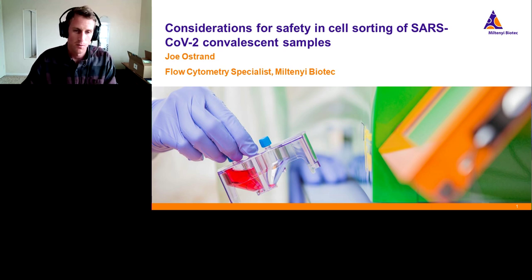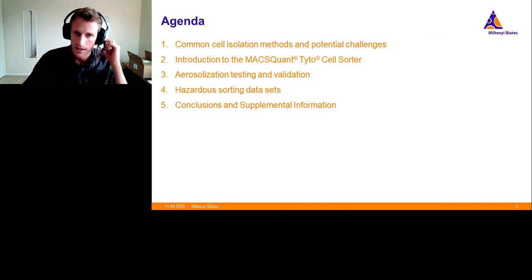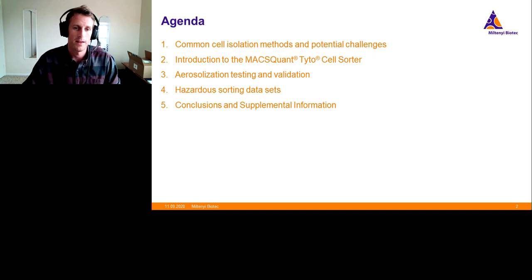But with that, I will go ahead and jump into this. From an agenda perspective, I want to go through the challenges with this type of work and really the advantages of using something like cell sorting technology, but it does come with caveats. I'll give you a little bit of background on our sorting instrument, the Tyto, and then talk about how a couple of groups have used that instrument and validated it for work with hazardous materials, and then go over a couple of applications that they've actually been able to run with it.